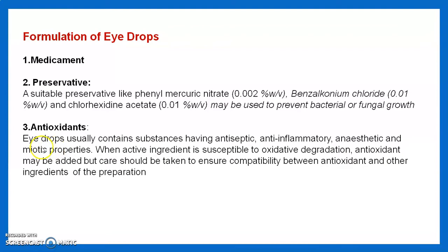Then antioxidants. Eye drops usually contain substances having antiseptic, anti-inflammatory, anesthetic and miotic properties. When an active ingredient is susceptible to oxidative degradation, an antioxidant may be added, but care should be taken to ensure compatibility between the antioxidant and other ingredients of the preparation.